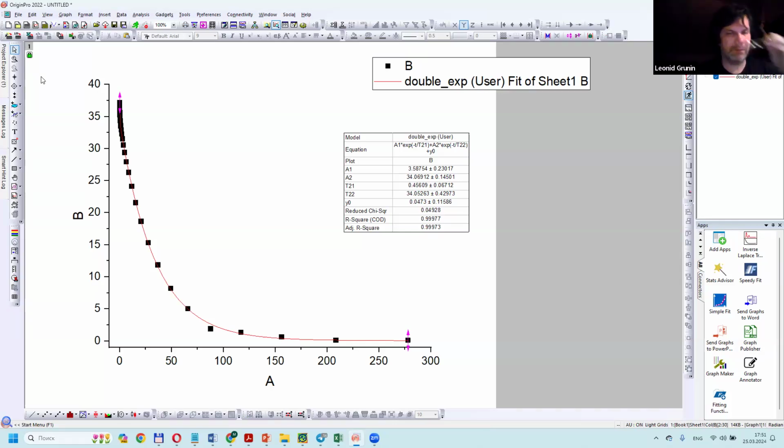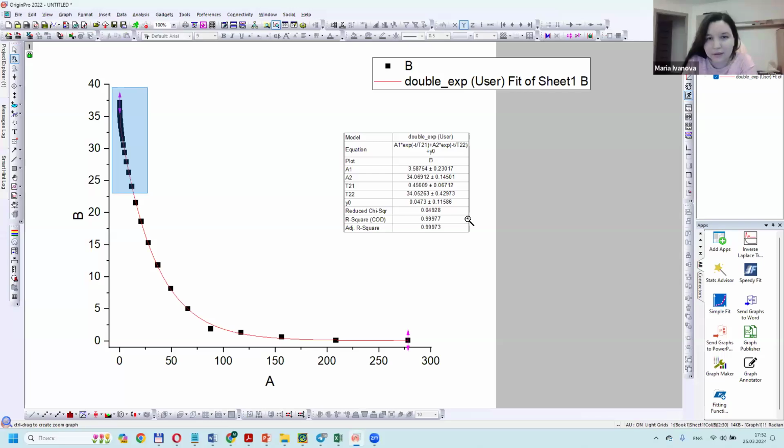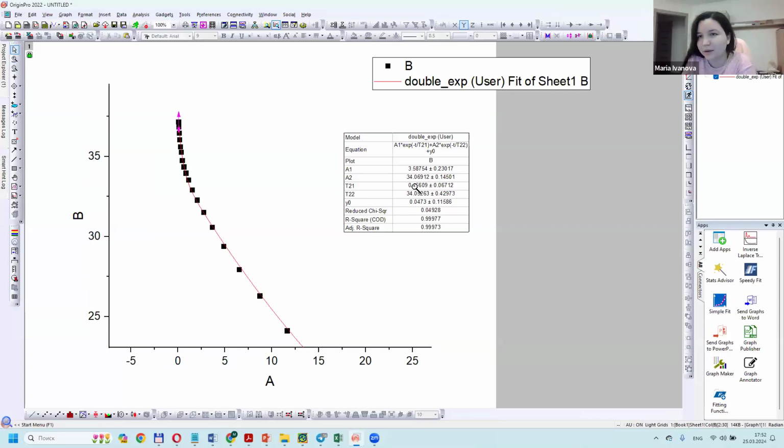Okay, this is in Relaxed. And the same in Origin. Yes, so we have the same T2 values and the same results. That's logical. So, great job, Masha. So guys, do you have more questions? I will stop recording.